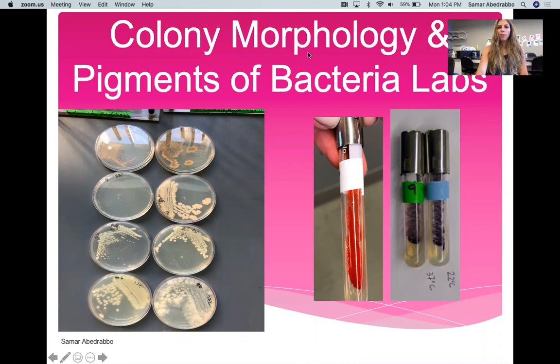In this first portion of the lab, you're going to try to determine which bacteria are what specific species by looking at specific morphology or shapes that bacteria have on agar plates. Here in this image, we see bacterial agar plates, and we can see that there are some distinguishing features. For example, this agar plate has some brown colonies on it. On these agar plates, the colonies are a bit fuzzy. So we're going to talk about that.